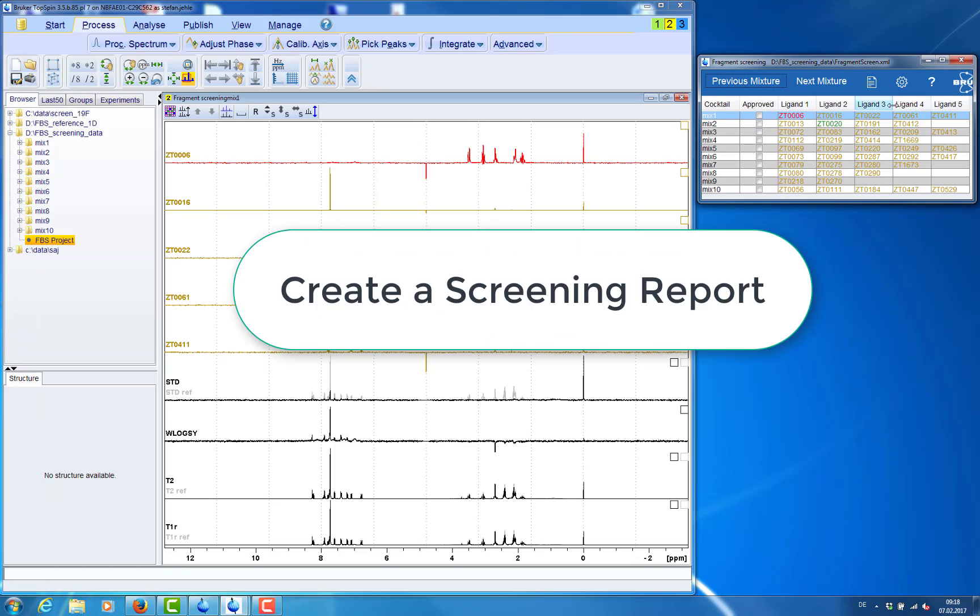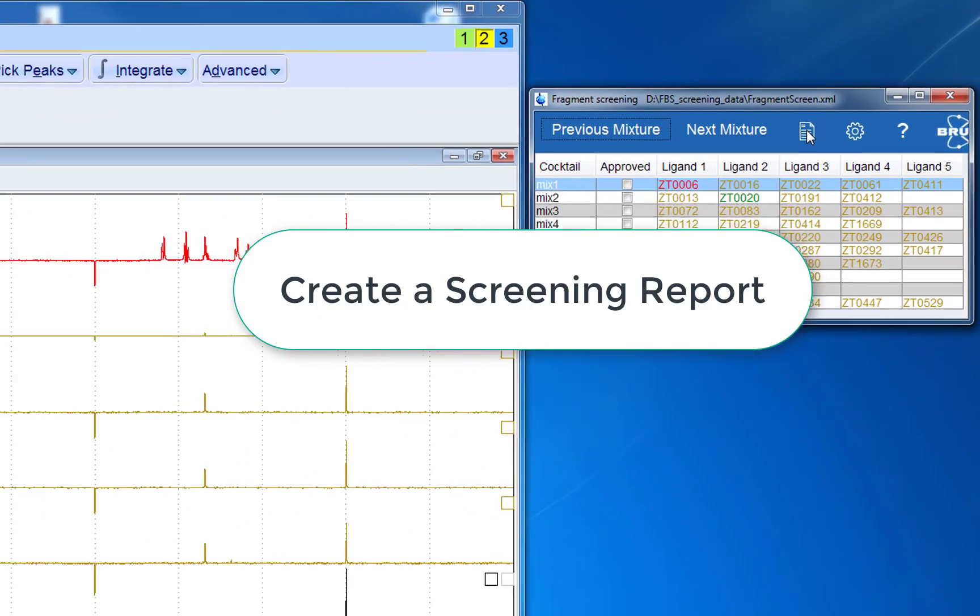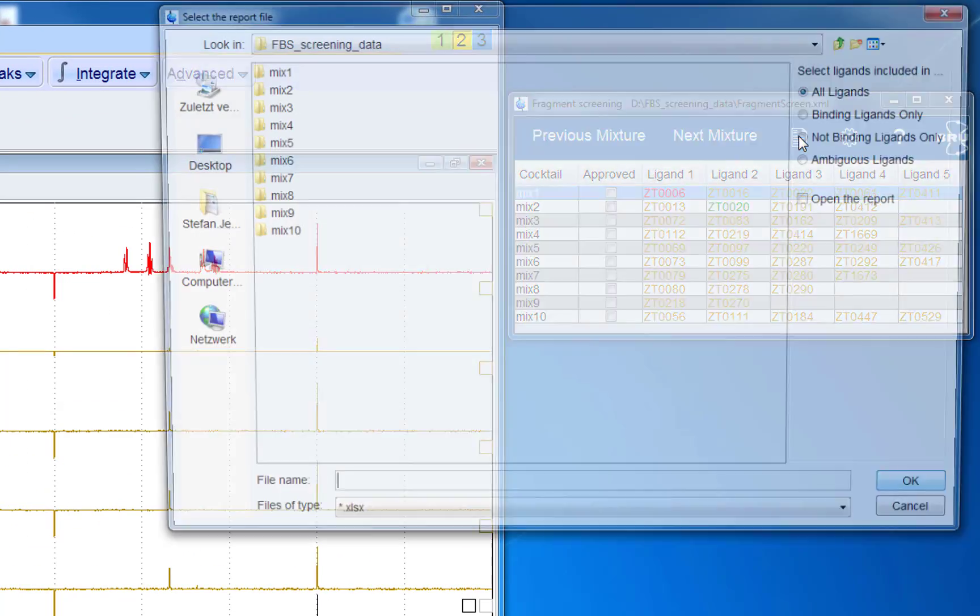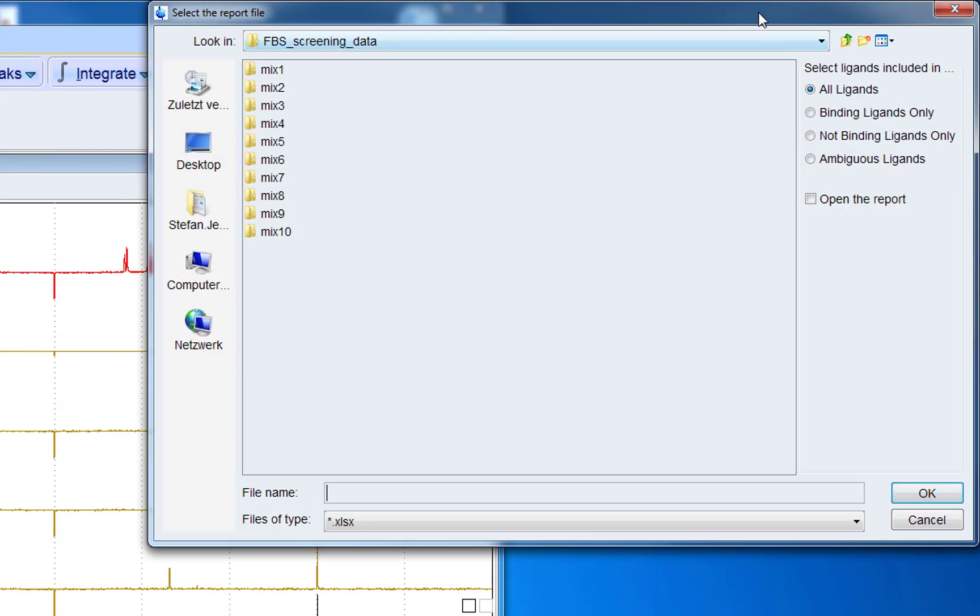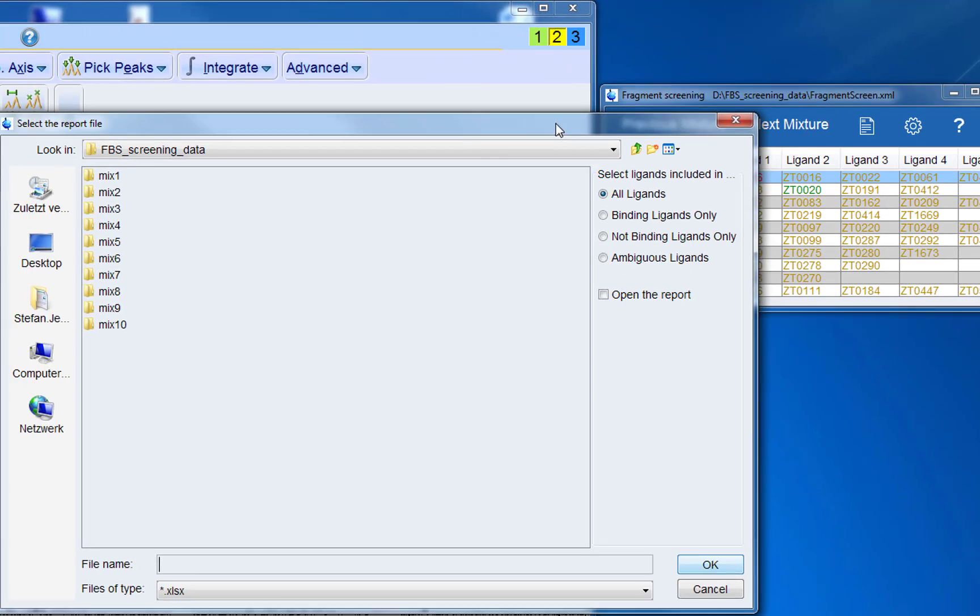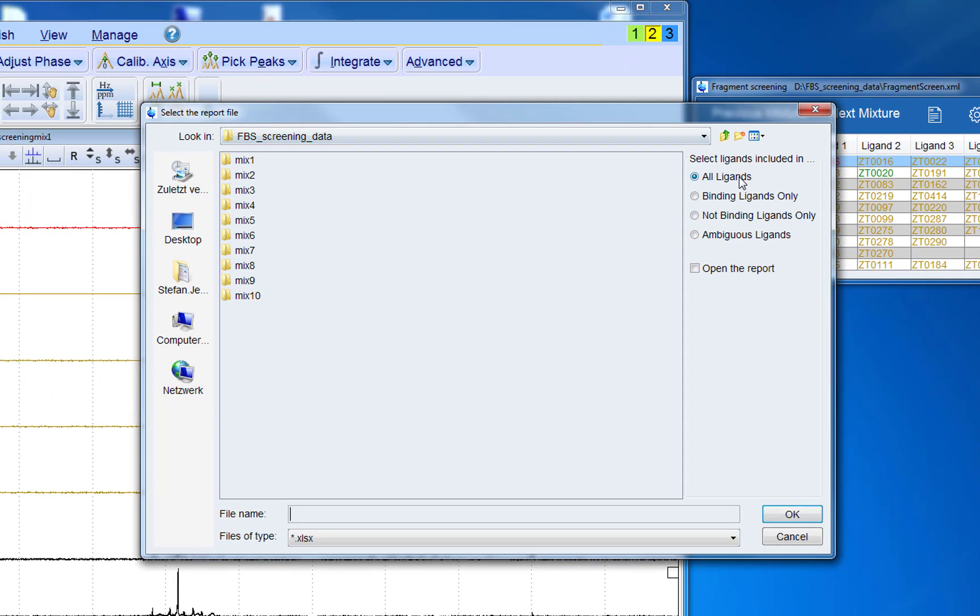Finally we want to make a screening report with our results. So we can click on the report button in the project table. And we can choose a name for our screening report.